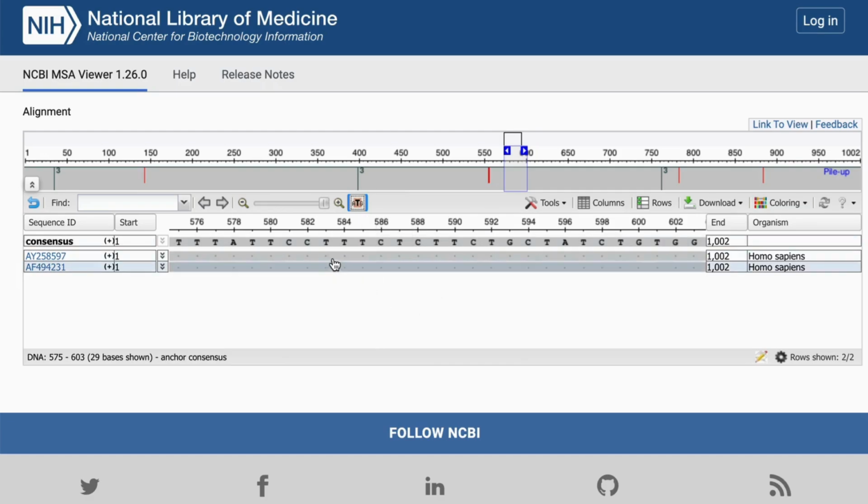You will notice that the sequences of the taster and non-taster alleles are mostly represented by dots, indicating that the sequences are identical to the consensus sequence. Only the SNVs are different. What is the position of the first SNV that you find? Move the slider to the next SNV and record its position.